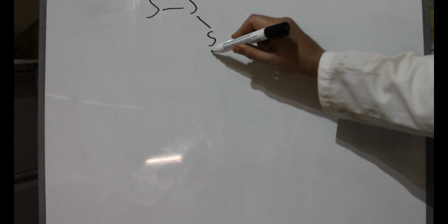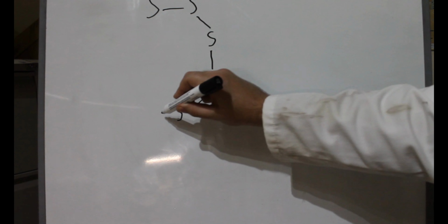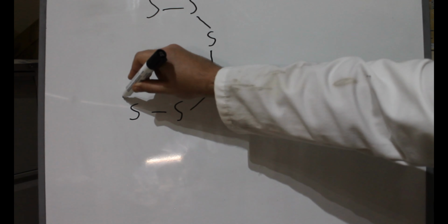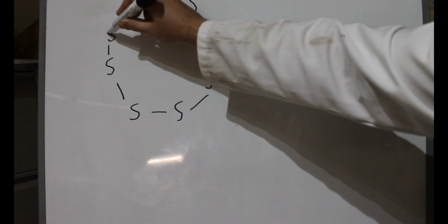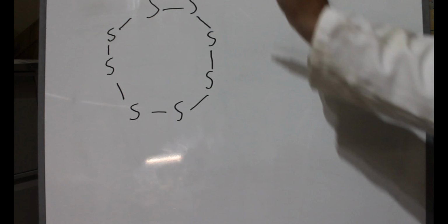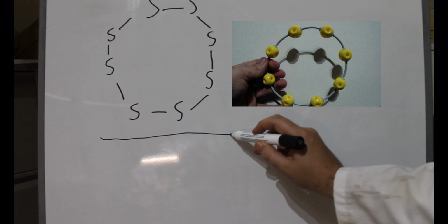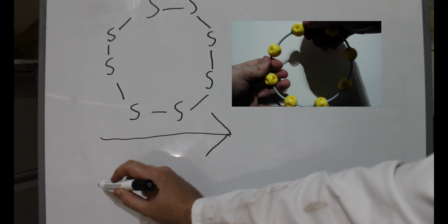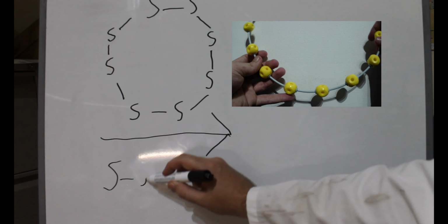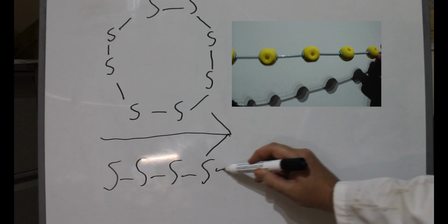At room temperature, sulphur takes the form of a stable 8-sided molecule in this circle formation. However, as the temperature goes above 160 degrees Celsius, sulphur forms these linear polymers. We can see this up at the side with our models as one connection splits and it spreads out into its linear polymer.